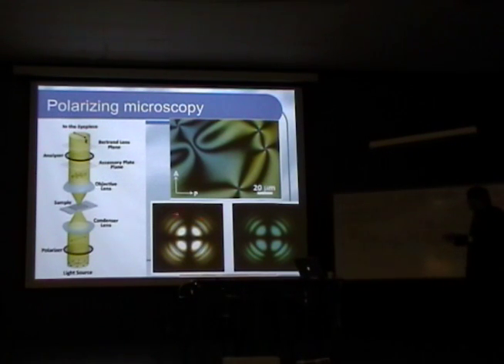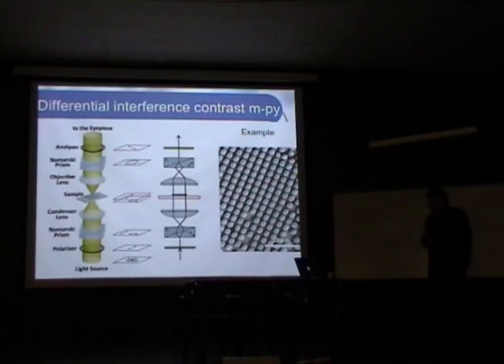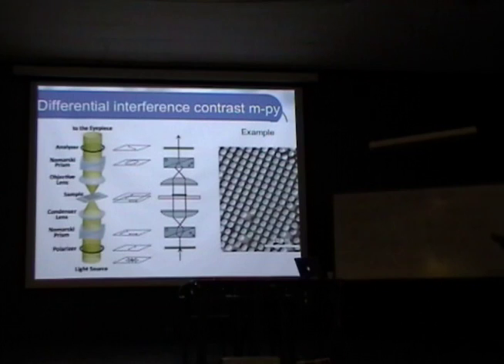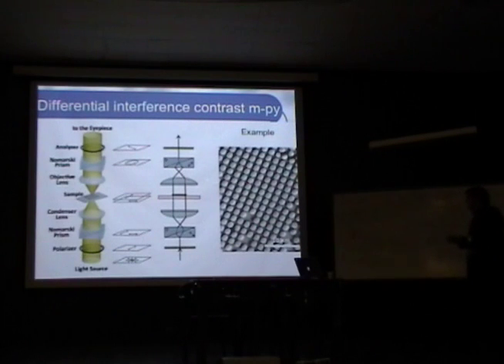And so then the interference image formed by light passing the sample at different angles has a form similar to the ones shown in here for the uniform orientation of the optical axis. And as I mentioned already, it can be used to probe orientation of optical axis and also to probe whether the sample is birefringent, or whether the sample is uniaxial or biaxial, as well as orientations of different axes of biaxial crystals.